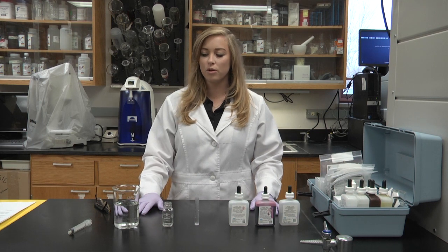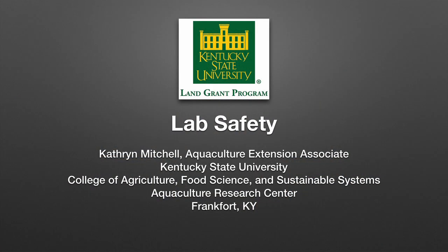Hi, I'm Catherine Mitchell. I work for Kentucky State University as an Aquaculture Extension Associate, and today I will be showing you how to test for water quality. Anytime you're working with chemicals, it is important to take safety precautions such as wearing a lab coat, long pants, close-toed shoes, gloves, and safety glasses or eyeglasses.